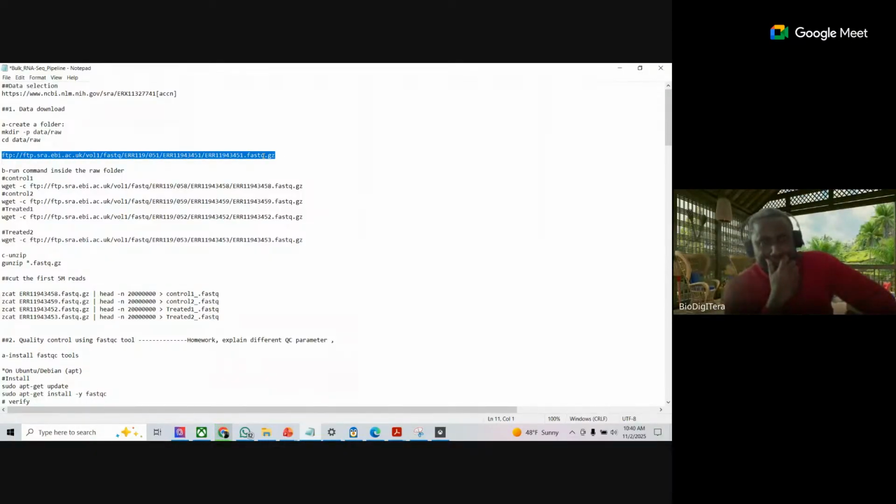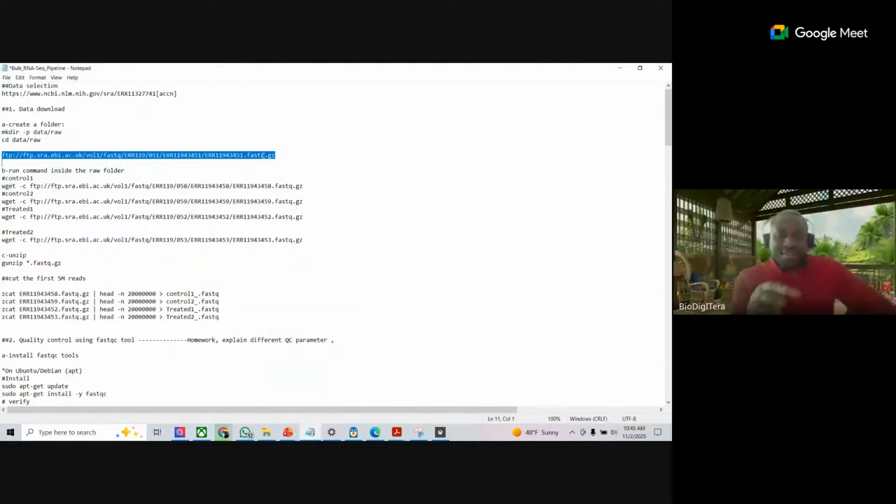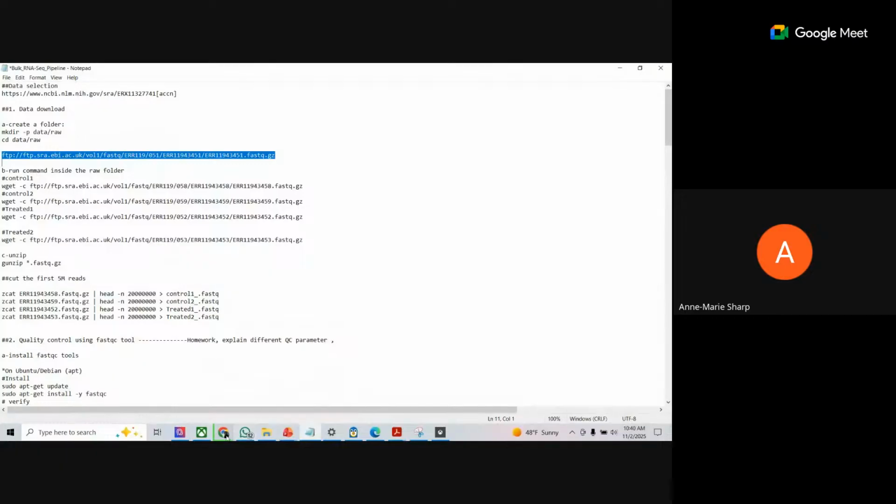Did you see what I did, guys? I already shared the link yesterday. What matters to me is to show you how you can extract any single sample by copying this. That's the most important. Did you see what I did? Yes, sir.